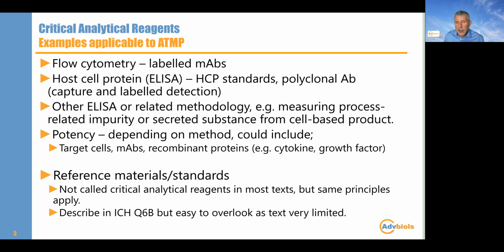So I've chosen to use a little bit of text from a new ICH document M10, which is bioanalytical method validation. EMA and FDA have guidances with pretty much the same name, which actually look remarkably similar. And in fact, PMDA have one that's really quite similar as well. But with differences in the text and varying amounts of text on this topic.